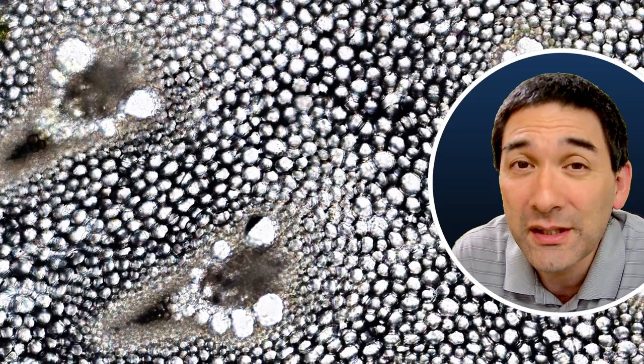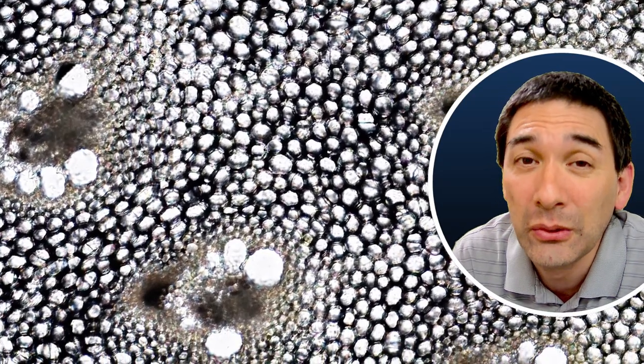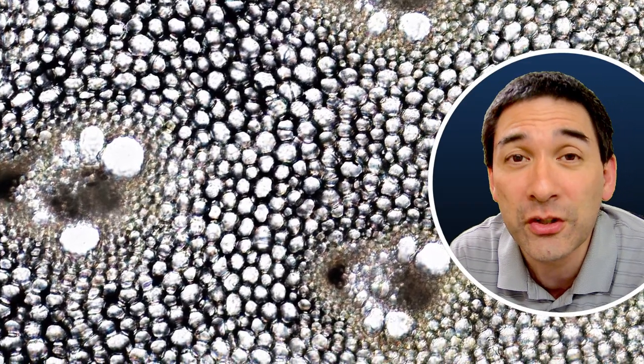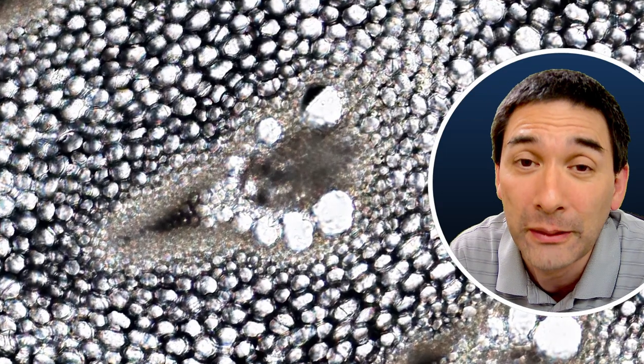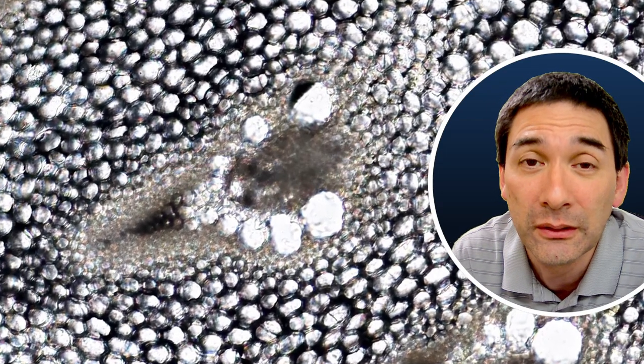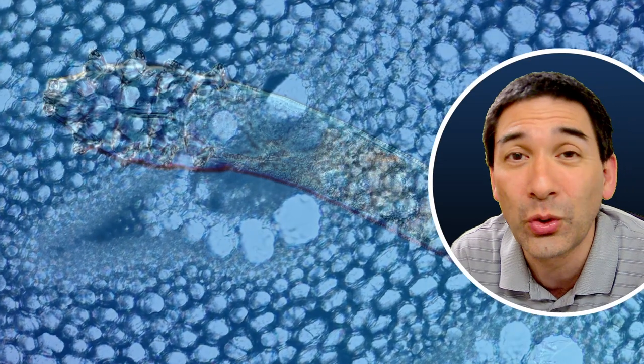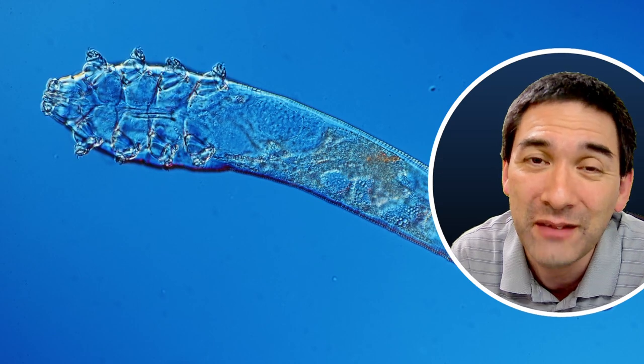And asparagus are basically so-called monocot plants, and you can see that by looking at the structure of the so-called vascular bundles under the microscope. The vascular bundles are those cells that transport water and nutrients up and down the plant. So that's a vascular bundle here, and they are arranged quite differently in monocot plants from the so-called dicot plants, and I will always explain this of course in the video.